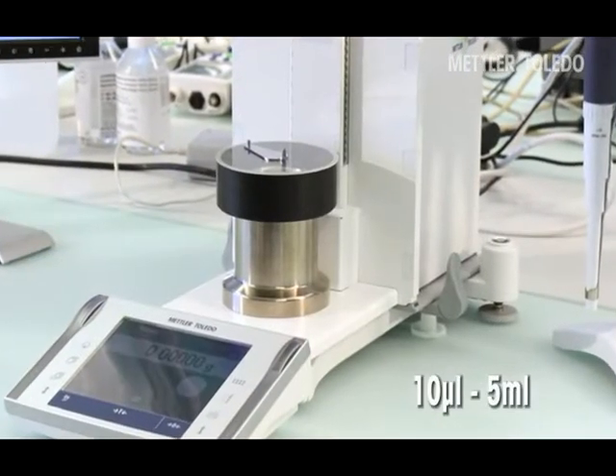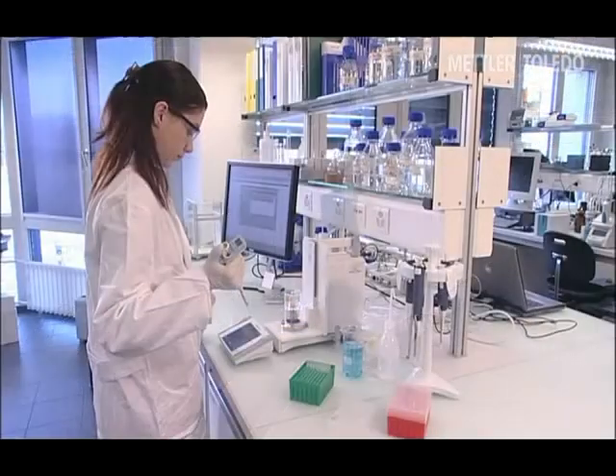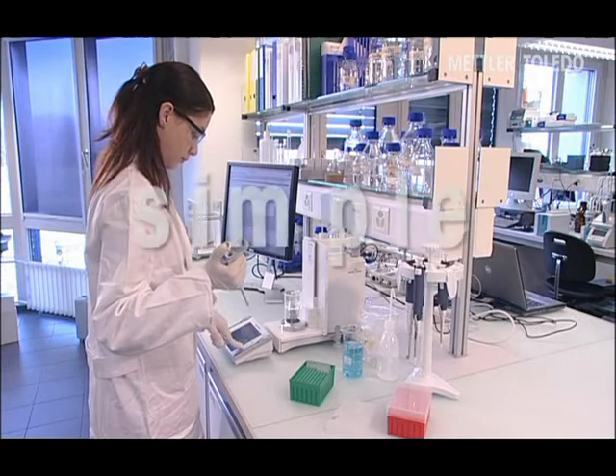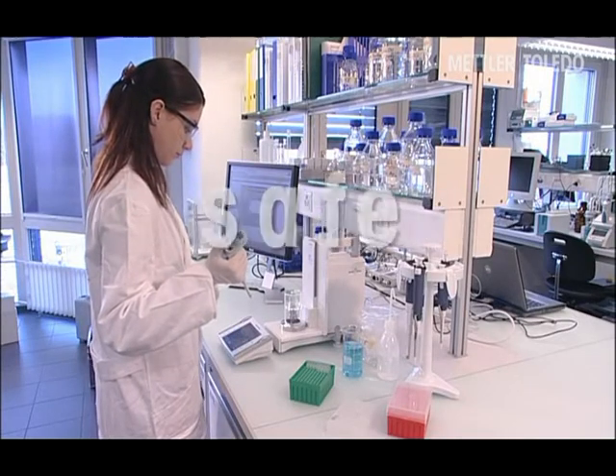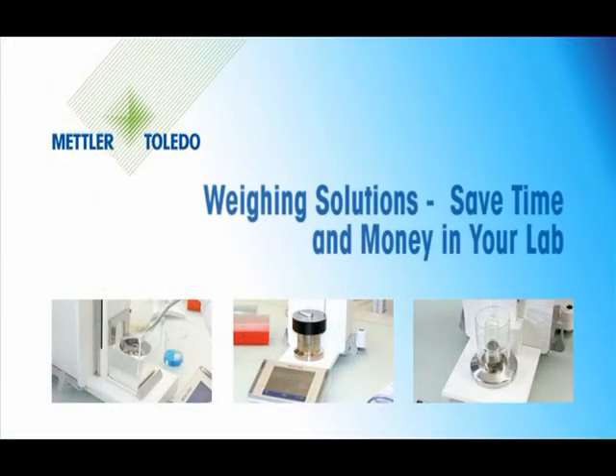Evaporation Traps — gravimetrical pipette testing with excellence balances. Simple, safe and fast. Mettler Toledo Weighing Solutions: save time and money in your lab.